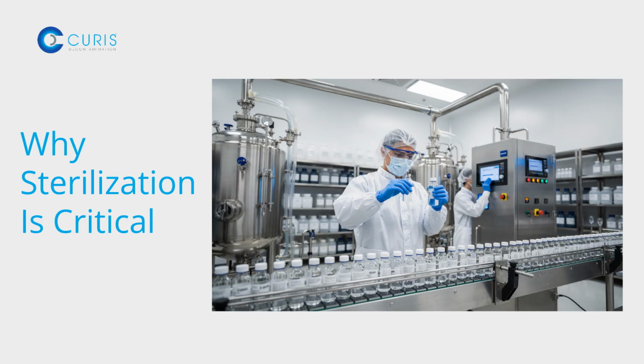Sterilization is the foundation of aseptic control. It ensures that surfaces, tools, equipment, and air are free of viable microorganisms capable of compromising sterility. True sterilization isn't just about cleanliness, it's about reducing the probability of surviving microorganisms to an extremely low level.